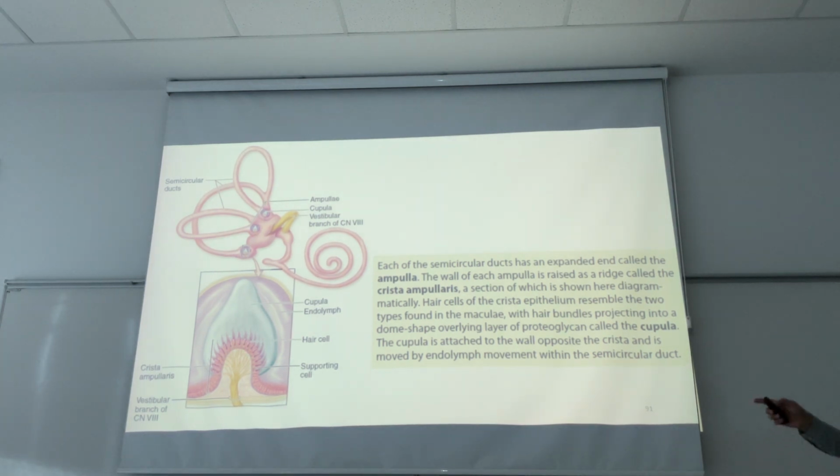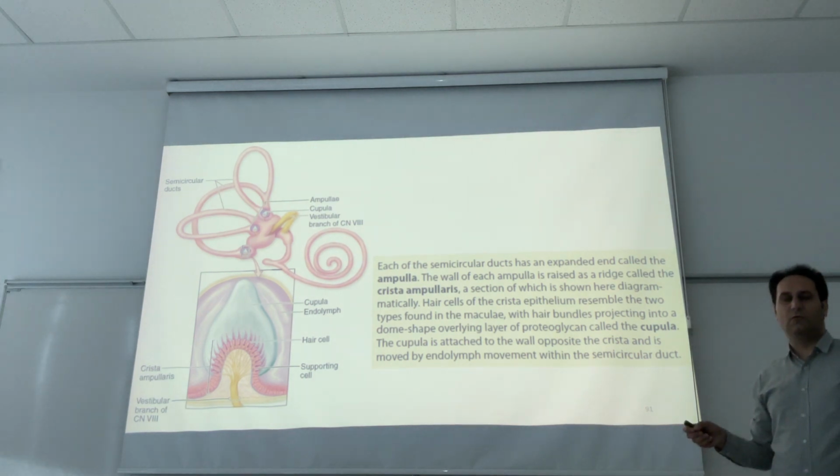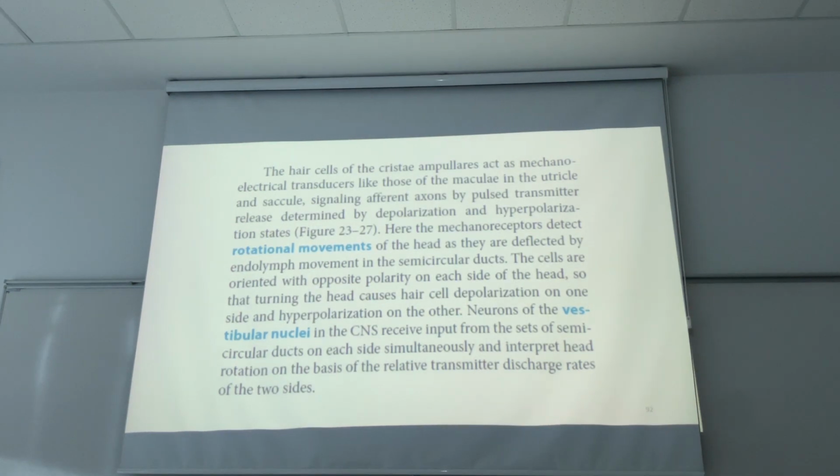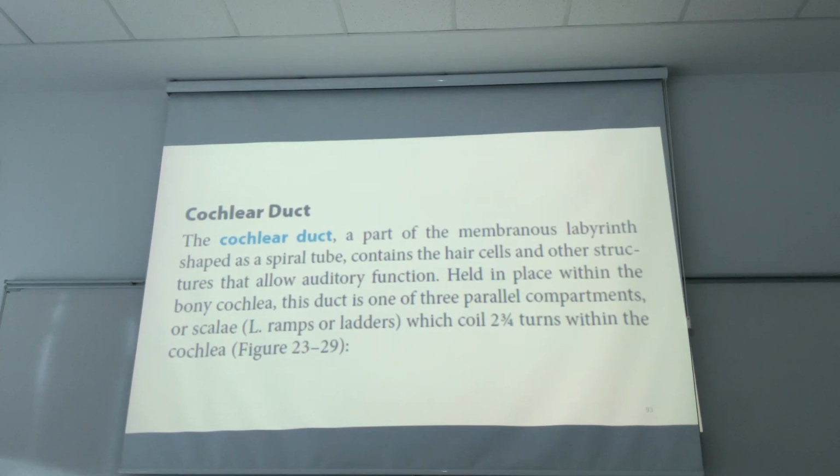Do you have questions about the cupula and macula? Can you understand the differences between the cupula and macula? What is the difference? Otolithic sand or otoliths or ear sands are not present in the crista ampullaris and cupula. Okay.